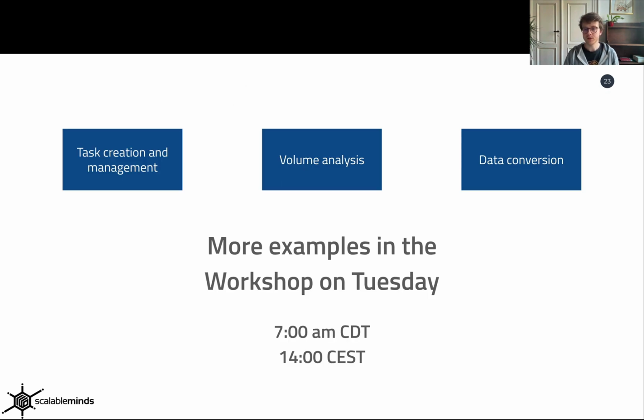We're going to have more examples in the workshop on Tuesday, where we're going to talk about how to create many tasks from a Python notebook, how to run an analysis on a volume annotation that you've created in webKnossos. And we're also going to talk about data conversion for how to convert data from webKnossos for another tool and vice versa.